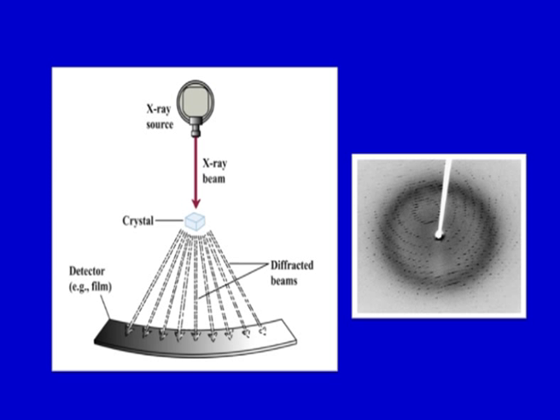Now, remember, as we have discussed in microscopy earlier, the higher the angle of diffraction, the more outer the diffraction is from the center axis. At the center, it is not diffracted. So, as you go along this angle, the higher the angle, the more will be the resolution. This is a screen, or it could be a photographic X-ray film, or a phosphorescence screen as in an imaging plate scanner, or there could be CCD detectors and other detectors. And finally, what you get is the diffraction pattern.